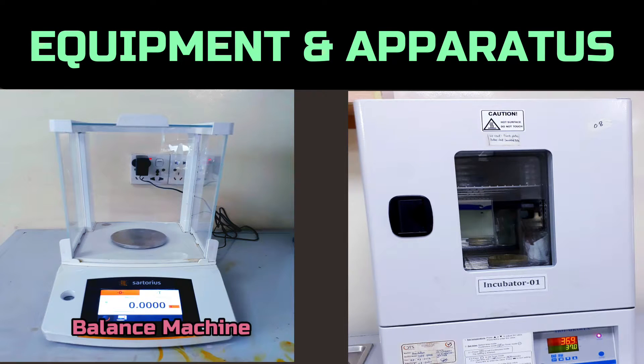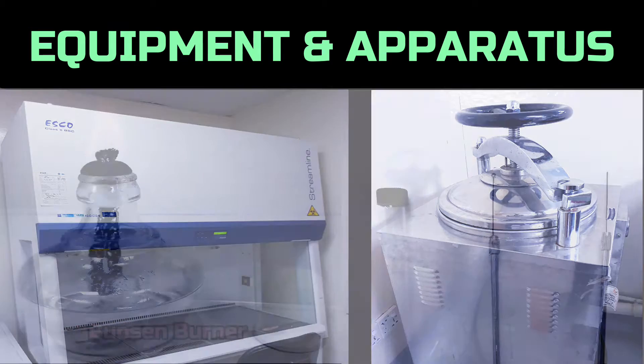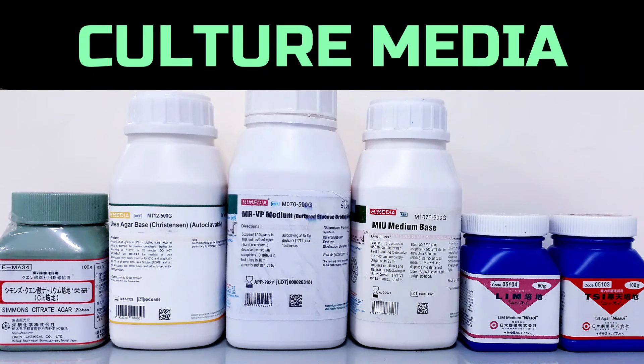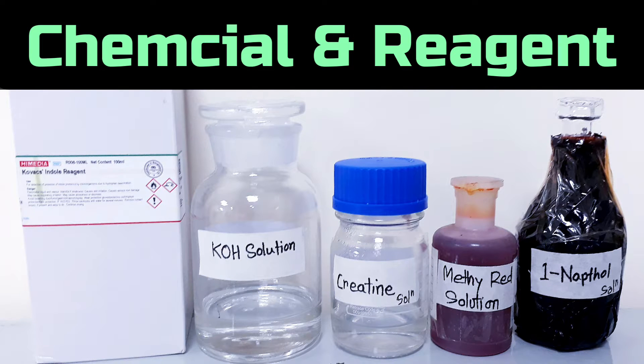To conduct the experiment, we need a balance, incubator, biosafety cabinet, autoclave, burner, screw-capped test tube, inoculating loop and needle, Simmons citrate agar, urea agar base, MRVP medium, MIU medium, LIM medium, TSI agar, Kovacs reagent, potassium hydroxide solution, creatine solution, methyl red solution, and 1-naphthol solution.